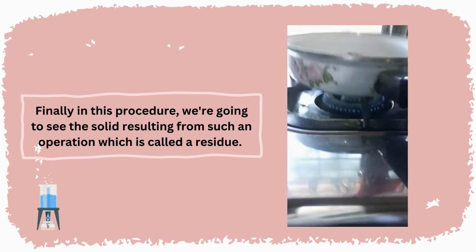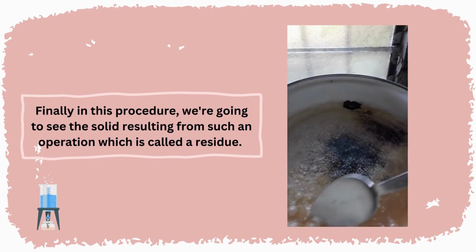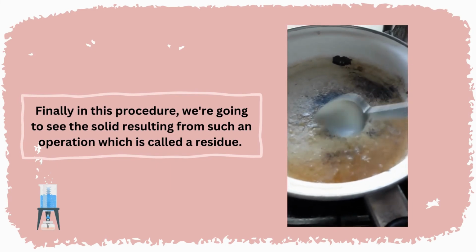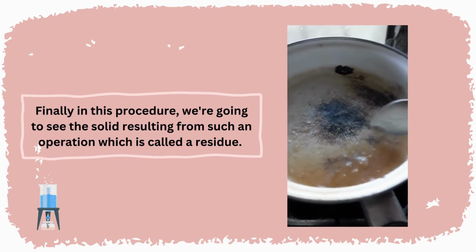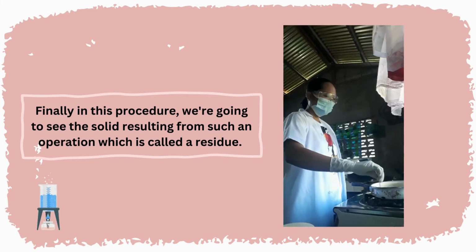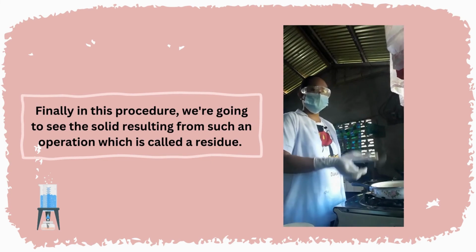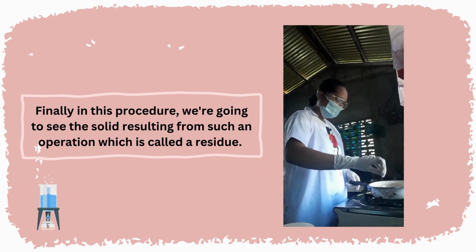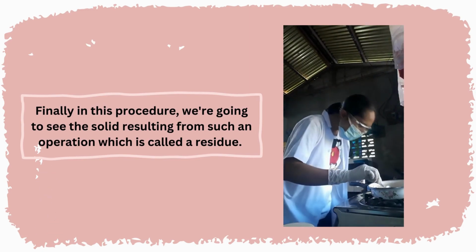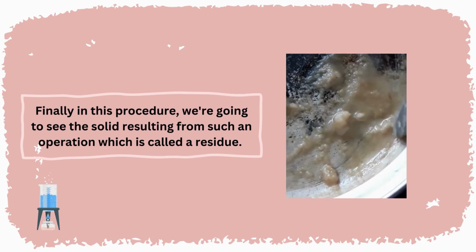So in this part, you can already see the white crystal formed, and continue scraping to avoid burning. Since all the liquid has been evaporated, turn off the gas and allow the contents to cool. The white crystal we see here is what we call a residue, the solid resulting.